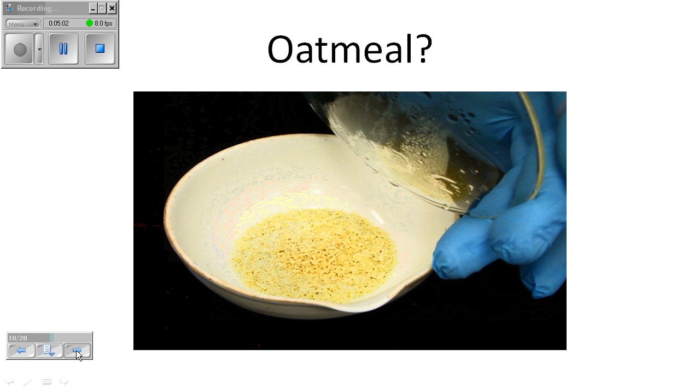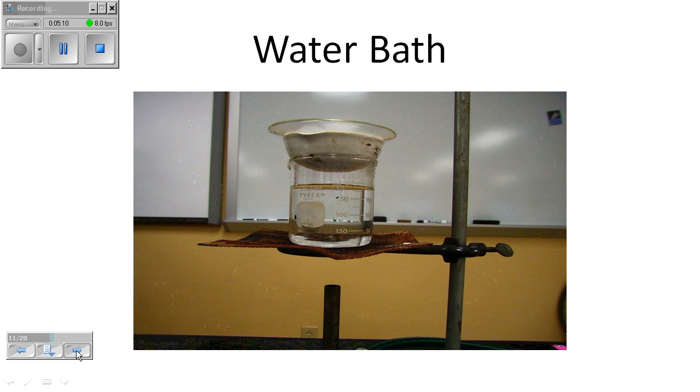It looks like oatmeal, malto meal, some kind of cooked breakfast cereal anyway, when the reaction is done. Now, once the reaction is done, again, you're going to go to your water bath. Hopefully, at this point, your water has had an opportunity to warm up some so that the heating can proceed immediately after you put it up on the water bath.